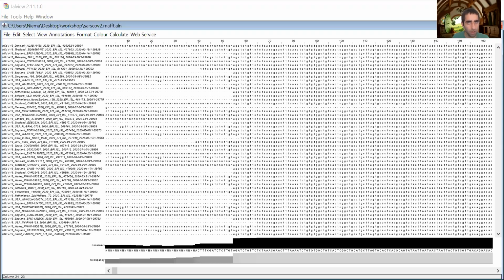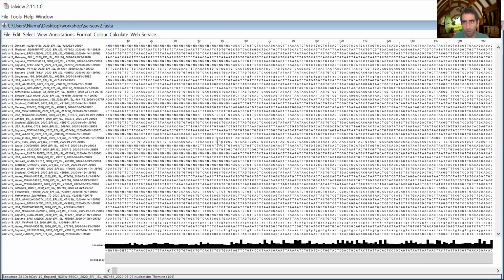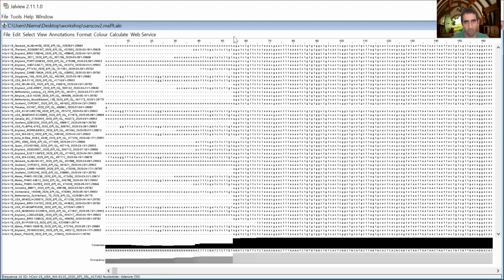It's loading. So what you'll notice is the original sequences, which are here, they're not very lined up, right? So what the multiple sequence alignment has done is it's taken our original sequences and has now lined them up nicely. This is the first step that any tool that infers evolutionary histories needs to have. It needs to have the sequences lined up.